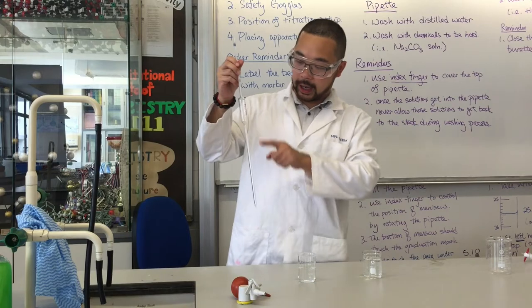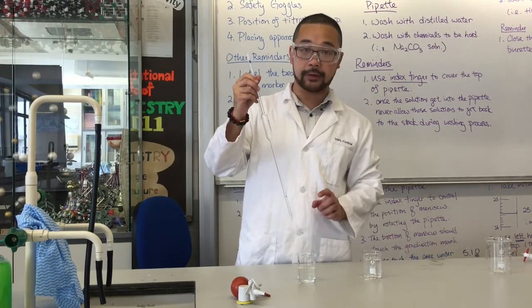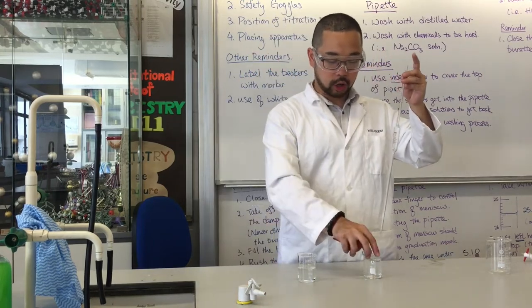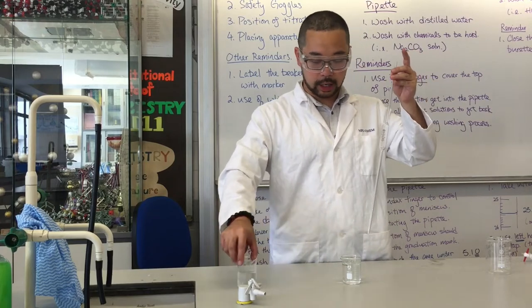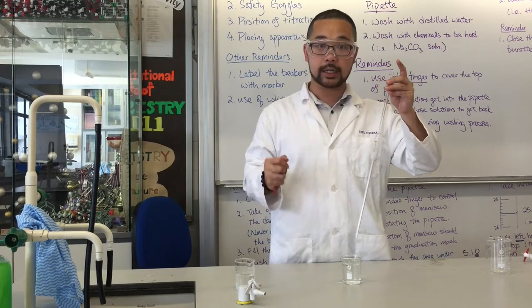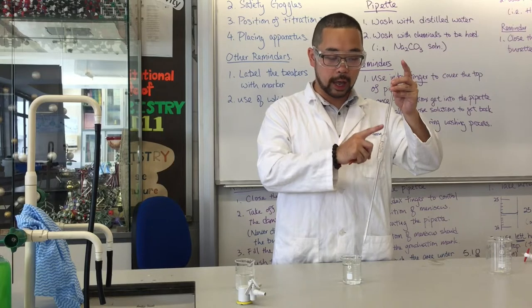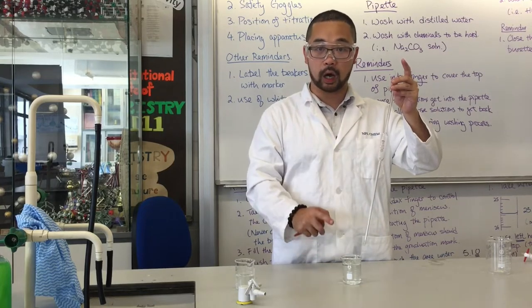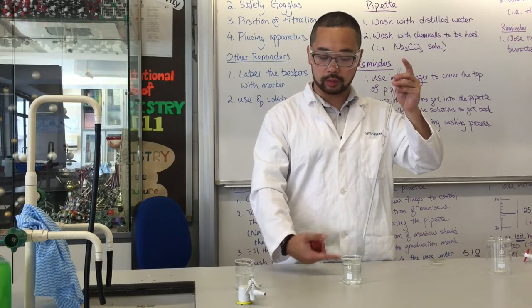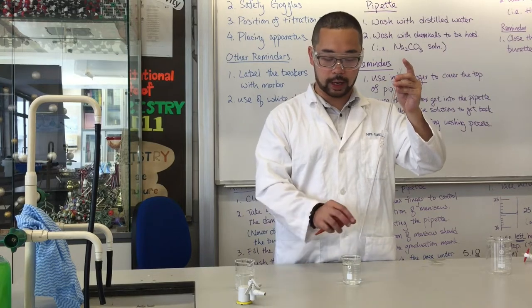As we have some water inside the pipette, if we take the solution and use it right now, it may have a dilution process. So what we need to do is use the chemical to be used, and then use this chemical to rinse away this water once more. But as I said before, after the liquid gets into the pipette, don't let that liquid get back into the beaker again. Because if we do that, we will contaminate or dilute the sodium carbonate stock right here.